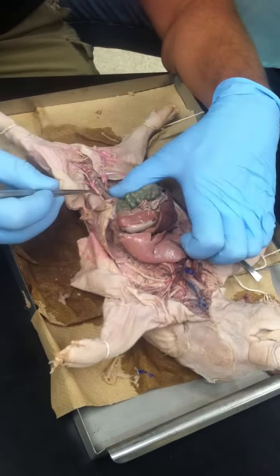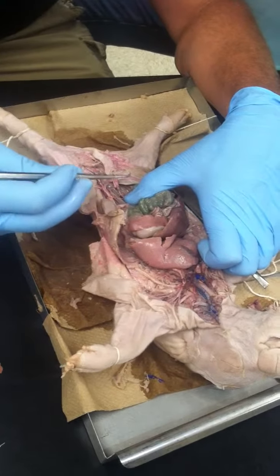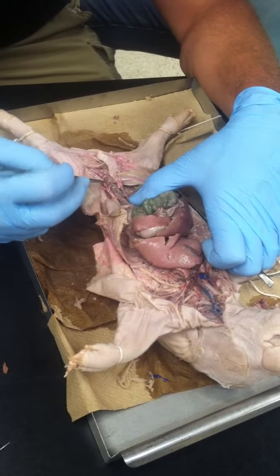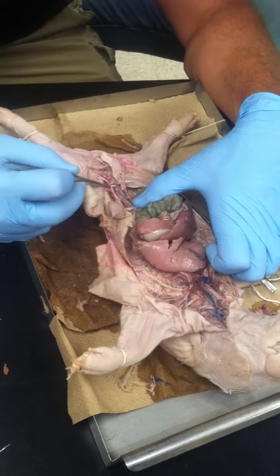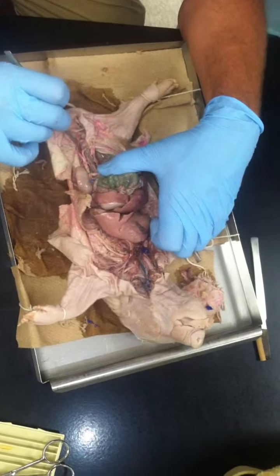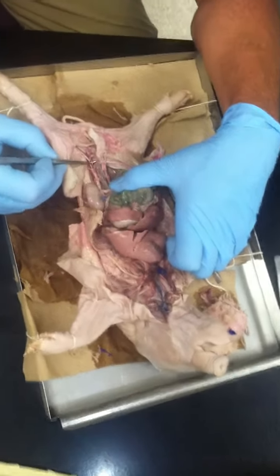You go down here to the abdominal aorta, the inferior portion of it. It's going to start branching. This first one we're going to use as our iliac. Artery, vein. This one you can see the artery. It's coming off of that aorta. The vein is behind that. It doesn't have any blue in it, so it didn't get the latex.